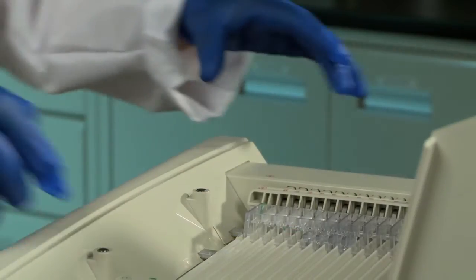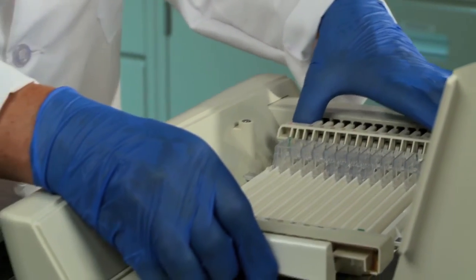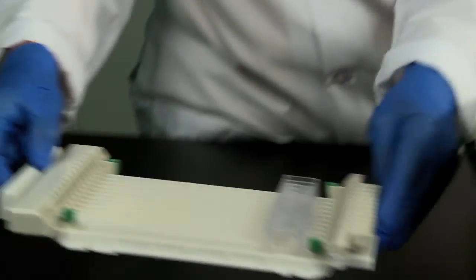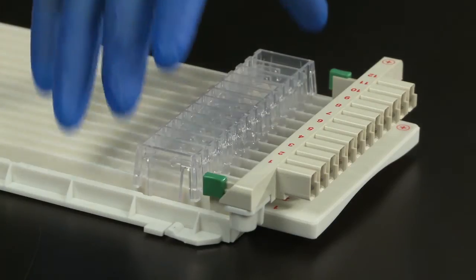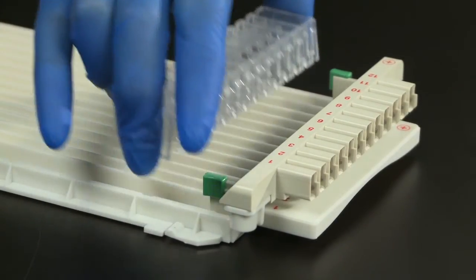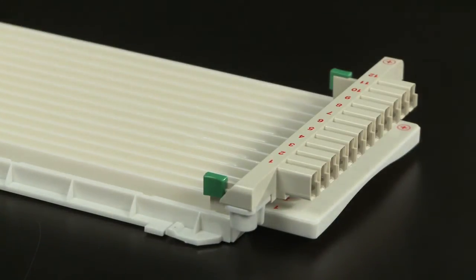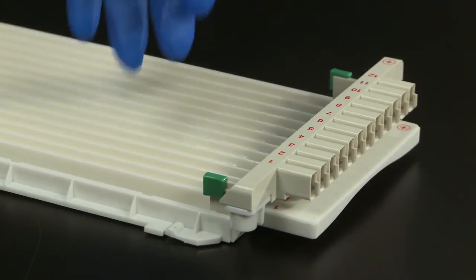After the run is finished, the tray can be removed by sliding it away from the electrodes and lifting it out of the instrument. Remove the cup holder and then the electrodes can be removed from the tray by pinching the green tabs and lifting up.